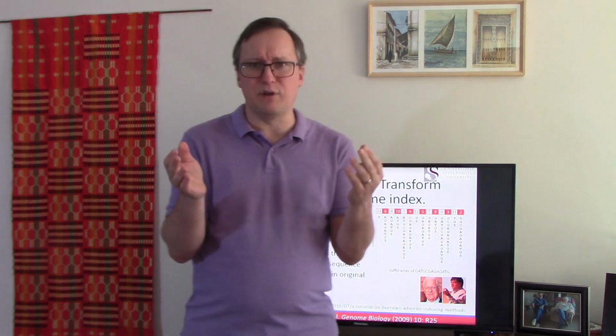Then I type a third letter, T. Now only the locations that are GAT are highlighted in our database. And then I add A again. Now even fewer, 1 in 64 locations. No, I'm sorry, I got that backward. Yeah, 4 of 16. In each case, we're cutting down by 4 how many locations in the genome match up to this. By the time you type the 60th letter, there are very, very few locations that are lit up at all, because they have to match all of these matching criteria, all of the letters I've entered.